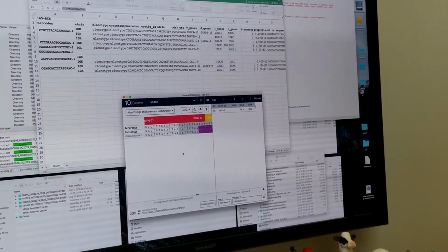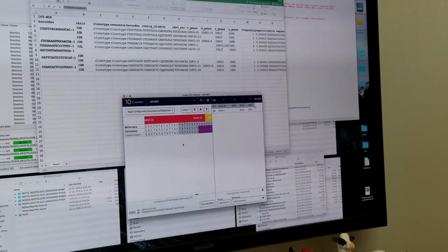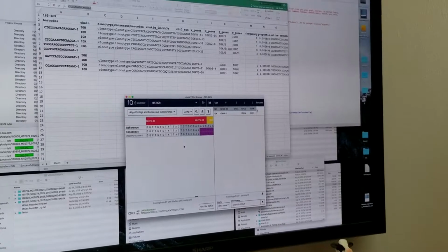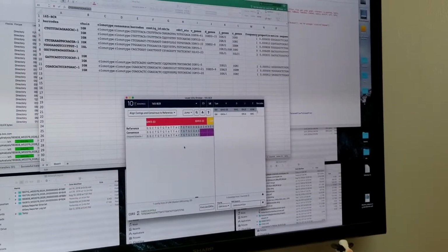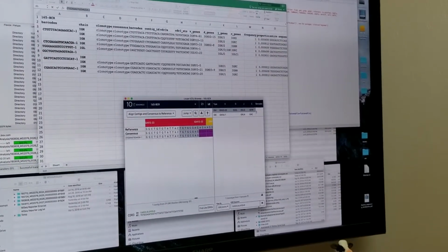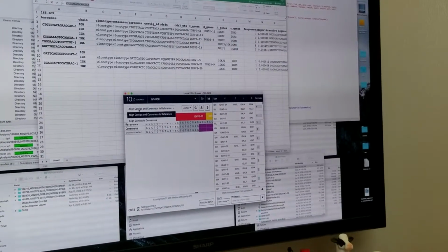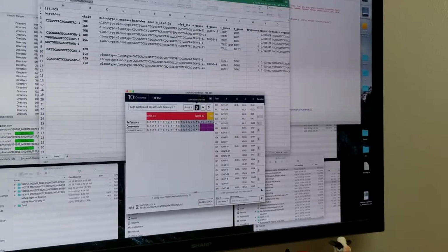I was going to ask this, but look at all of the heavy chains and get an overview, because we just picked the ones we thought based on the phenotype of the cell. They have this BAM file, right?